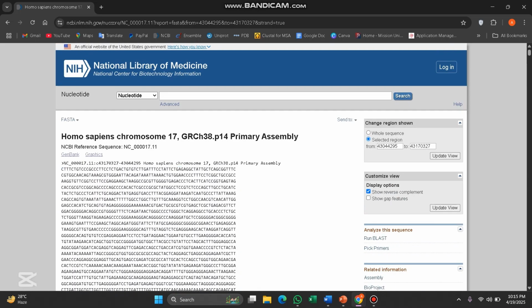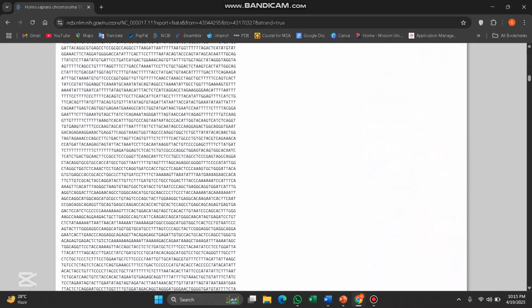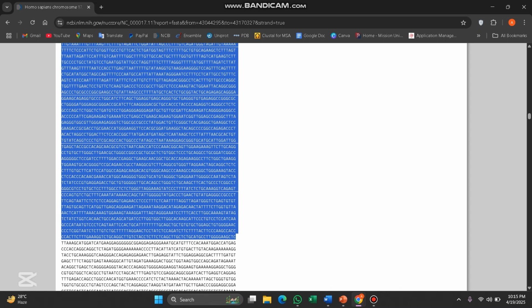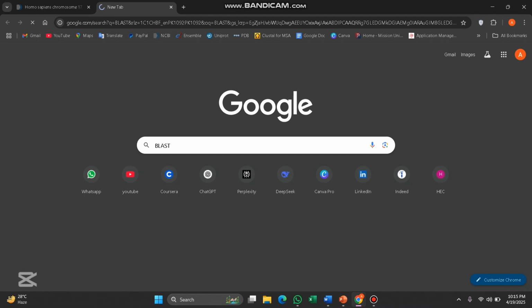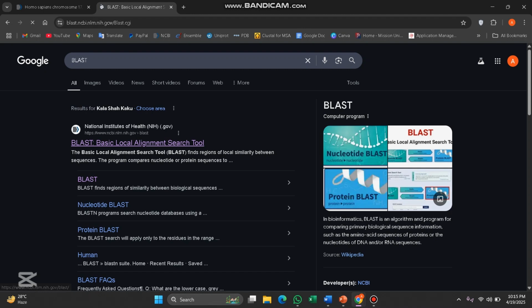Just copy this one. Then open a new tab and write BLAST, press enter, and click on BLAST, Basic Local Alignment Search Tool.